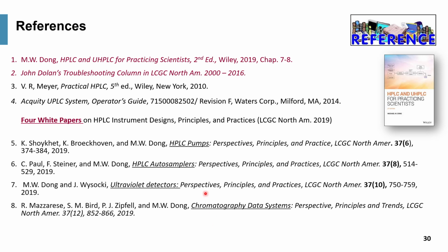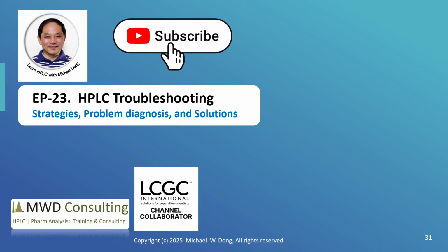Here's my reference list, and we want to point out that chapters 7 and 8 of the book are a good reference source, and also some of the white papers here. On this last slide, we cover video number 23 on HPLC troubleshooting. We discussed strategy, problem diagnosis, and mitigation solutions.